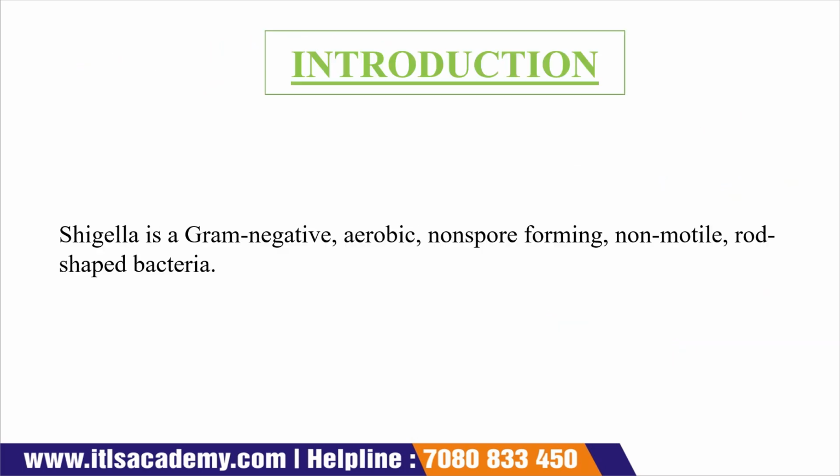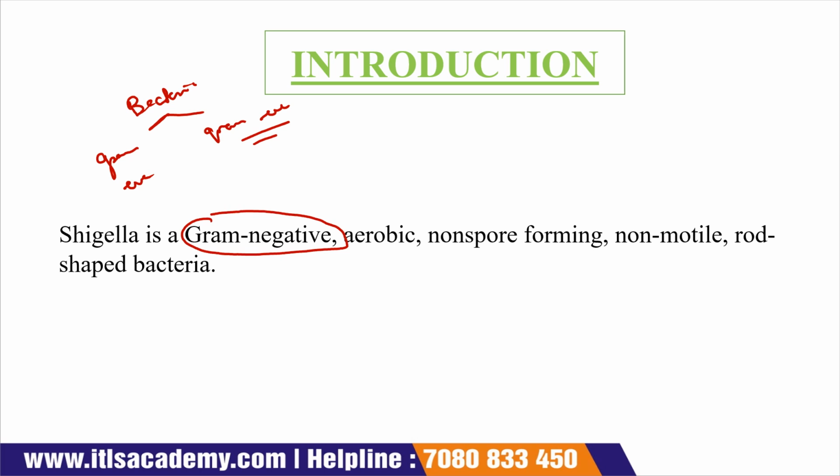The first thing is your introduction. We all know that Shigella is a gram negative bacteria. We all know that bacteria are of two types: one is gram positive and one is gram negative. And how do we find out whether a particular bacteria is gram negative or gram positive? We perform a gram staining. If we get purple colonies, then the bacteria is gram positive.